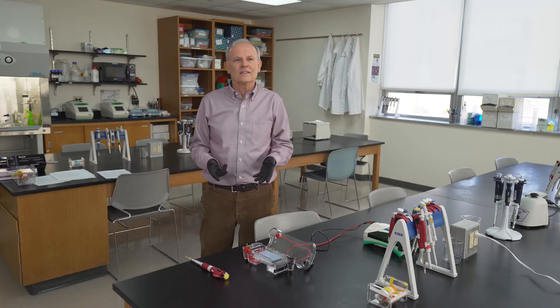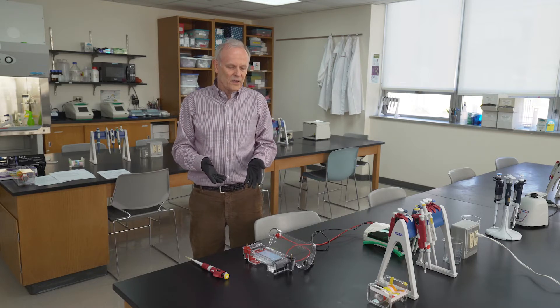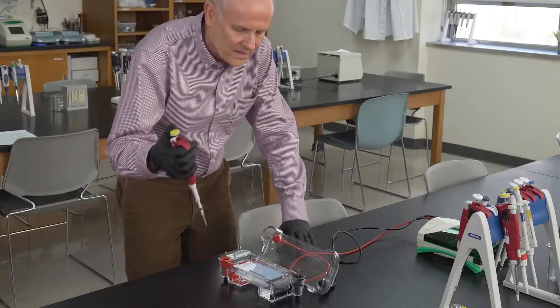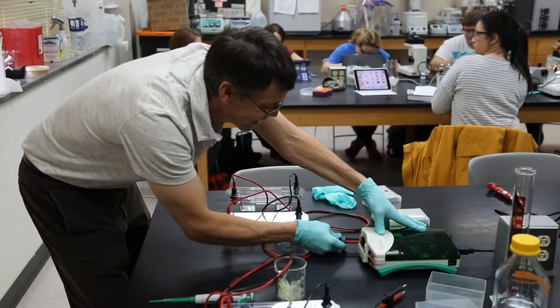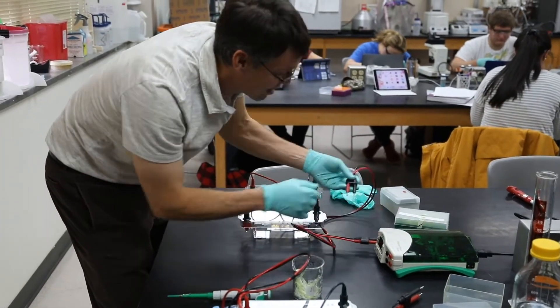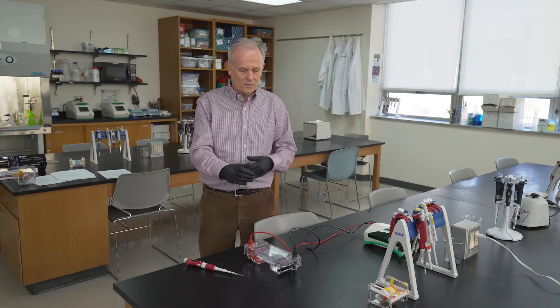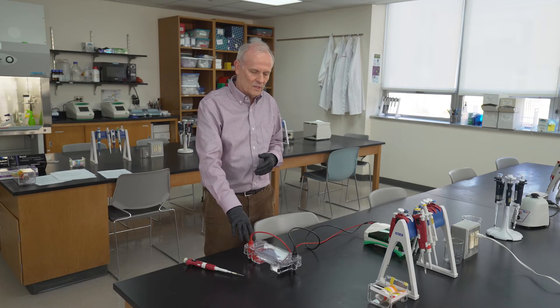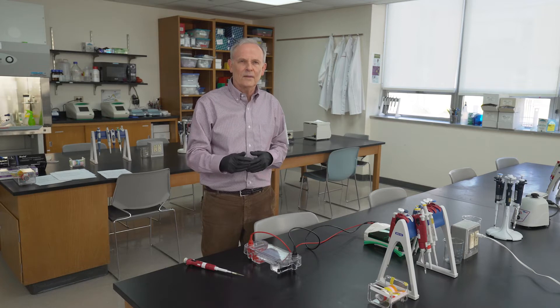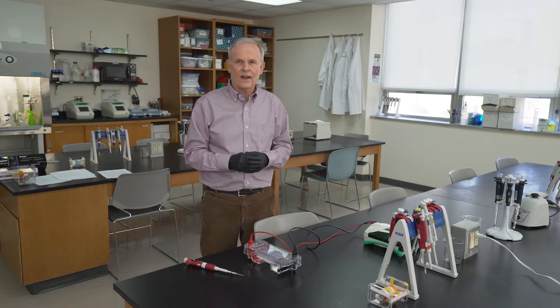Once we've amplified our DNA in the thermocycler, what we want to do is see if we've been successful in amplifying certain bands. We use a gel electrophoresis apparatus and load our samples into these wells. We attach it to a power supply and put an electric field across it. The DNA, which is negatively charged, will move towards the positive terminal, and larger fragments move slower than smaller fragments, creating a series of bands based on the size of the fragments.